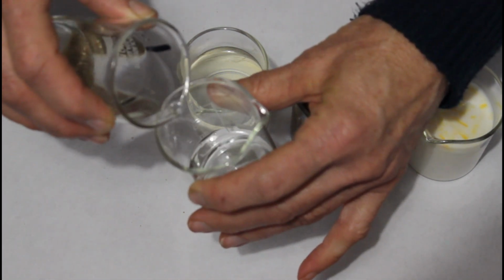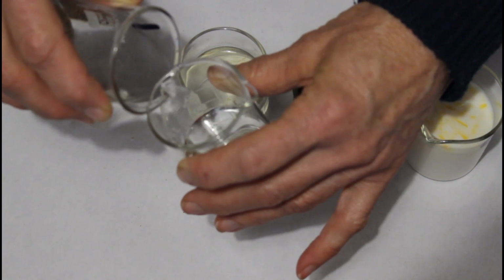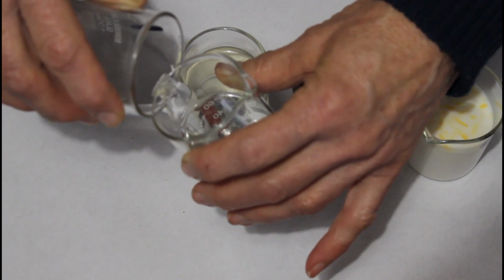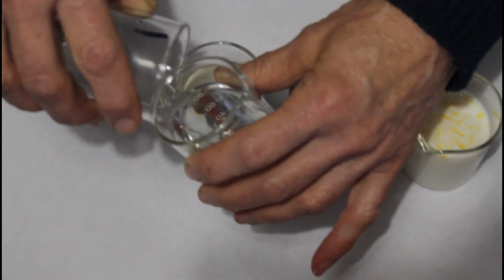Some of the sand has already just started to run down there, but now we can take it off. And so soon we'll be able to separate, or settle and decant, the sand particles from the water particles.